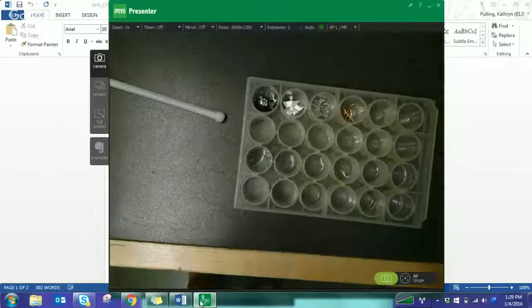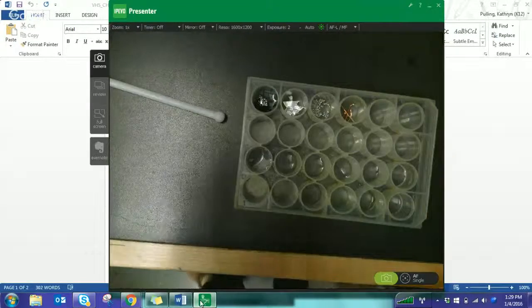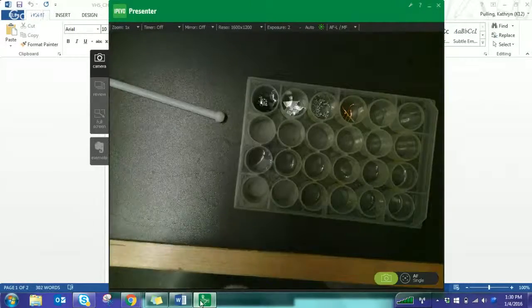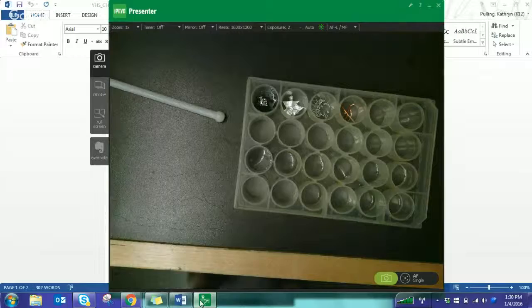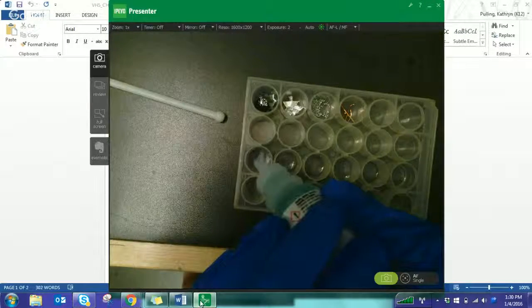All right, one thing, if you ever notice a reaction start right away when you add the first chemical into one of your wells, it means it wasn't clean. Okay? So always keep an eye out for that. If that happens, try a different well, or you might have to redo that one after you've cleaned up. All right, so let's add copper sulfate. See what happens. So sodium chloride. We'll keep going until we get a reaction.